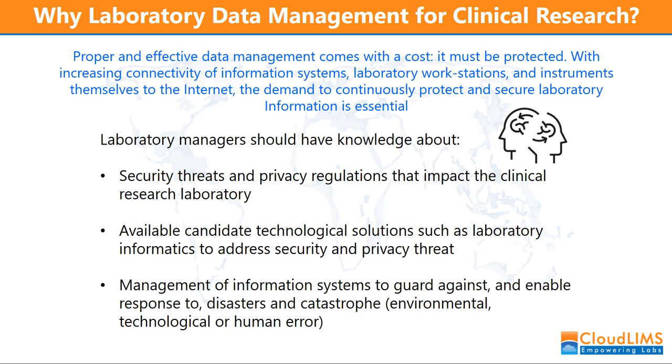Laboratory managers need to be knowledgeable about security threats and privacy regulations that impact their clinical research laboratory. And you should be aware of the technological solutions that address security and privacy threats to your data systems. You should have a plan to guard against threats, whether they're intrusions, environmental disasters, or human errors.